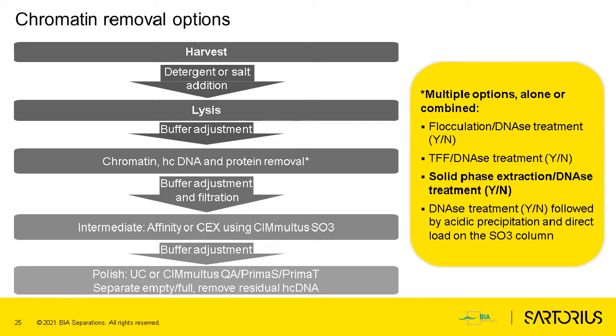And with these methods in place, we can start to really think how to develop the process. When it comes to AAV, if the AAV is not burst out of the cell, we need to lyse the cell. Usually two possibilities exist, either detergent or salt lysis.